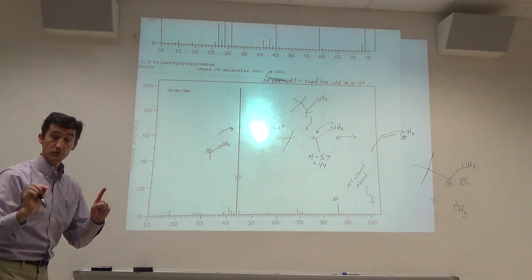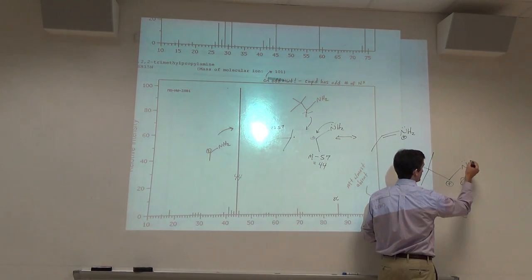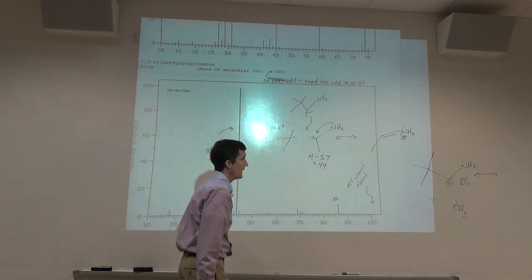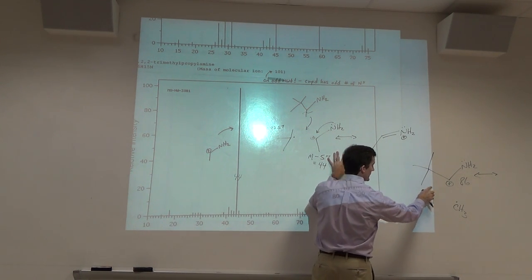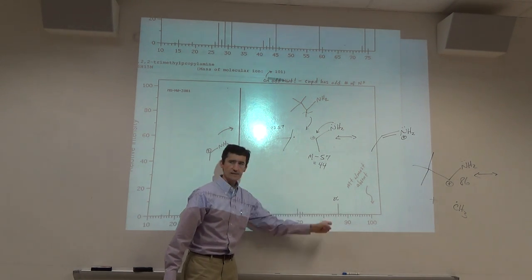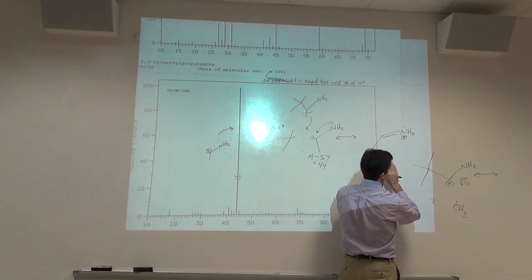Very often you can do two alpha cleavages. You can cleave here or here and give this resonance stabilized cation or this resonance stabilized cation. I won't draw the resonance structure, but here. Well, let's look at this. Both of these cations are resonance stabilized. Both would be predicted. Well, why is 44 so much more favored than 86? Why is this pathway more favorable than this pathway?